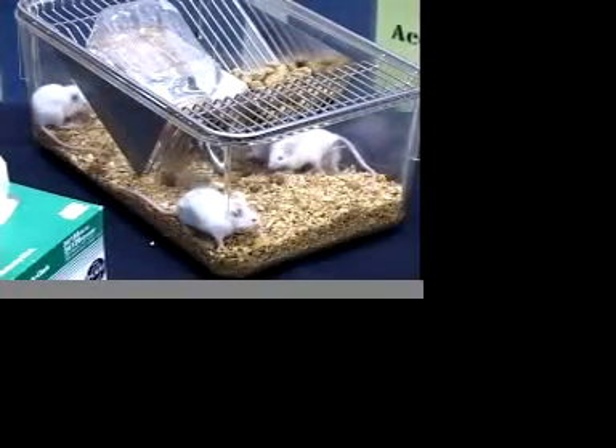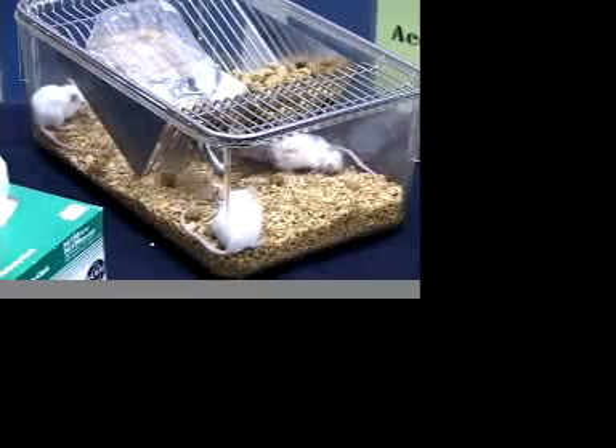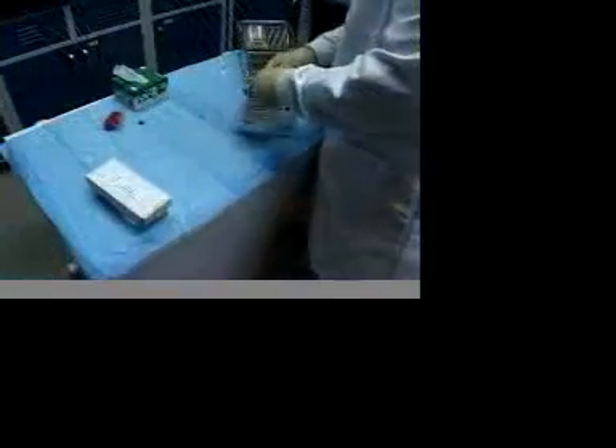The Goldenrod Animal Lancet from Medipoint has many advantages over other bleeding methods for mice. No anesthesia, surgical procedures, or restraint apparatus is required.